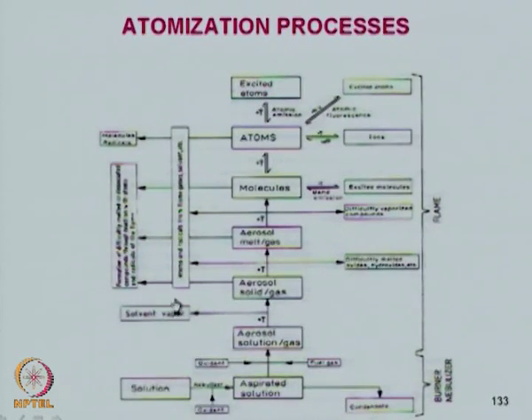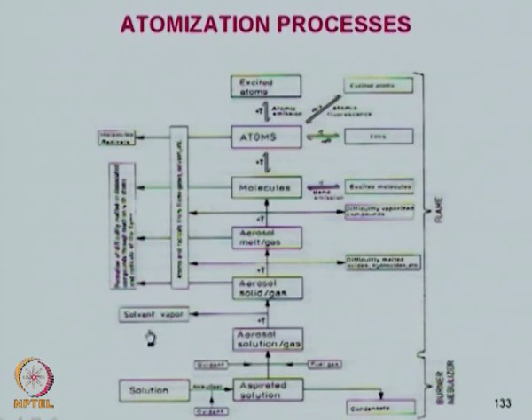The processes recorded on the left side of the burner in this area correspond to the nebulizer operations, and in this area the processes are recorded with respect to the flame when the sample enters the flame.